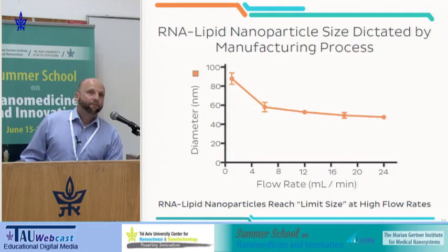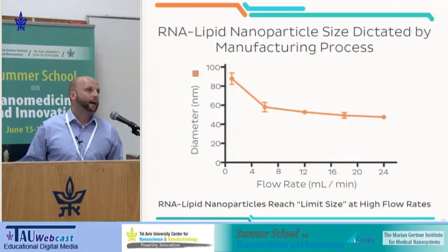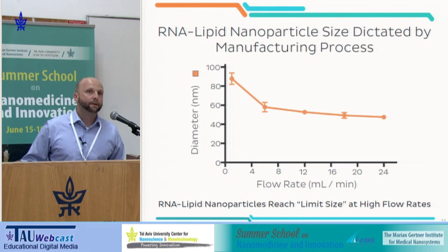Now, with that, I haven't really talked about the advantage of the microfluidics itself, but with the microfluidic technology, because of that control, you really get the ability to then start to do rational design of your nanoparticle systems. So I'll show both the ability to manipulate various characteristics of nanoparticles using process and composition.